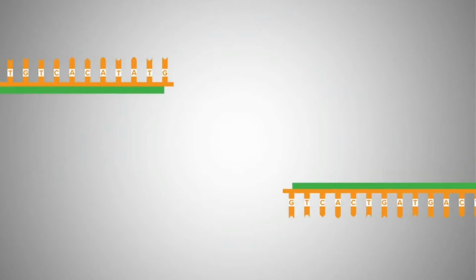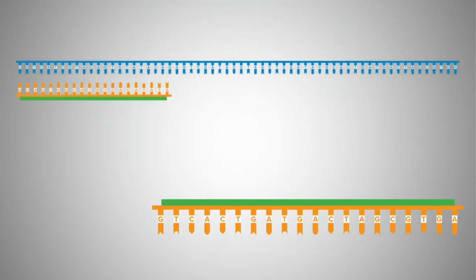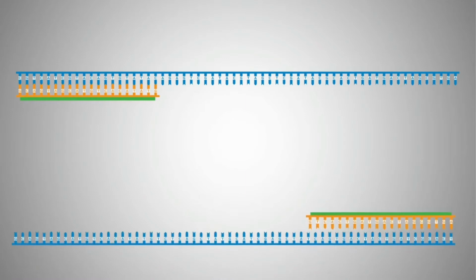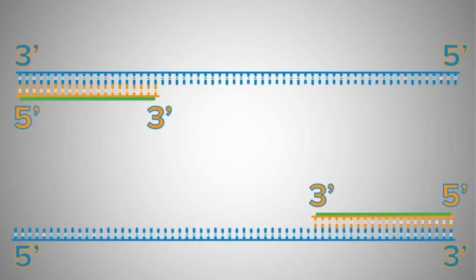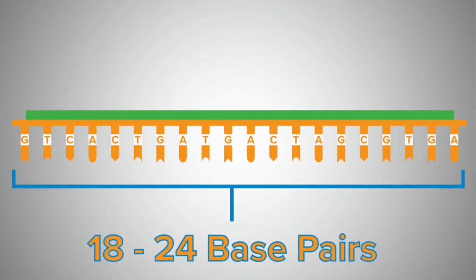A primer is a short single-stranded nucleic acid utilized by all living organisms in the initiation of DNA synthesis. The polymerase chain reaction or PCR uses a pair of custom primers to direct DNA elongation toward each other at opposite ends of the sequence being amplified. These primers are typically between 18 and 24 bases in length and must code for only the specific upstream and downstream sites of the sequence being amplified. A primer that can bind to multiple regions along the DNA will amplify them all, eliminating the purpose of PCR.